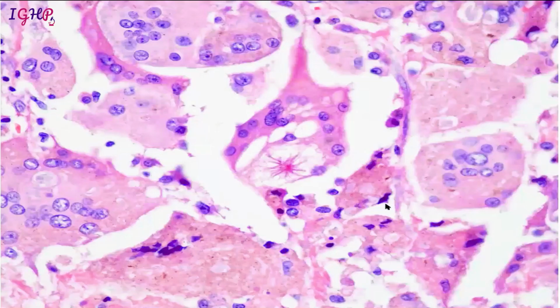And then this is a beautiful slide which is showing an asteroid body here within a giant cell. So we know that asteroid bodies are generally found in sarcoidosis, but it is not the only thing. So we should be aware of the other areas where similar things are found. If you see an asteroid body, you should not jump to a diagnosis of sarcoidosis. These are common findings in other giant cells also. And this is an asteroid body in a case of foreign body giant cell reaction. So there could be contaminants, there could be common things which are seen at an uncommon place, and you should be able to identify the normal things at those areas.